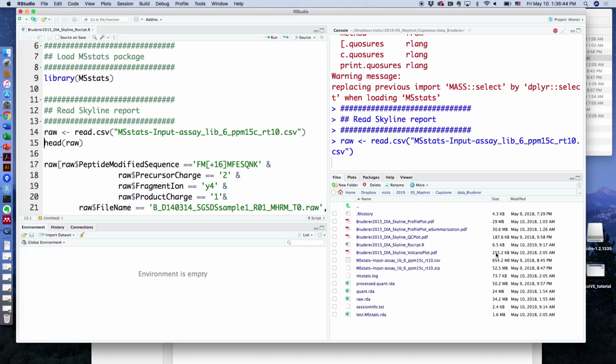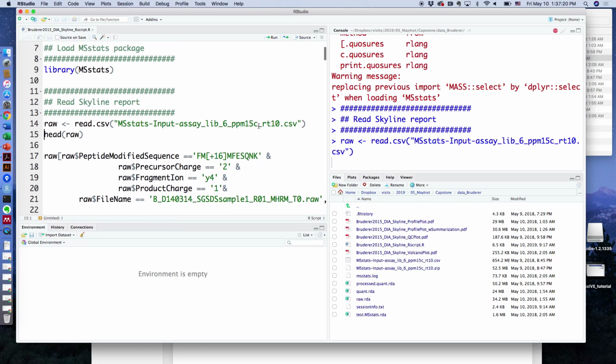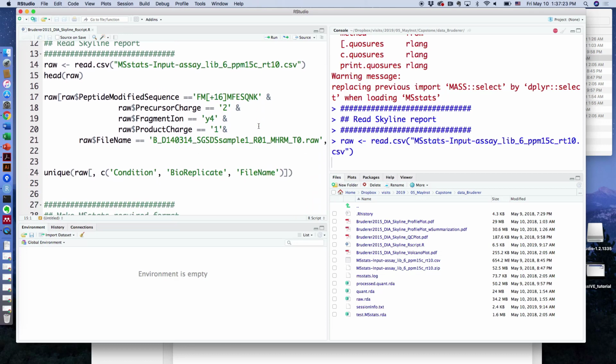For DDA cases, what we practiced for iPRG, for example the iPRG data, on my computer just data processing and testing takes less than 5 minutes. But in the DIA case, with a relatively similar number of proteins but a much larger number of features, for this computer, for 1D DIA cases, it takes 1 or 1.5 hours. That is a rough estimate of time. You see, it already takes a while just to read the data set. This is just reading. It depends on the number of processors of the computer, and it can also be better with more RAM.